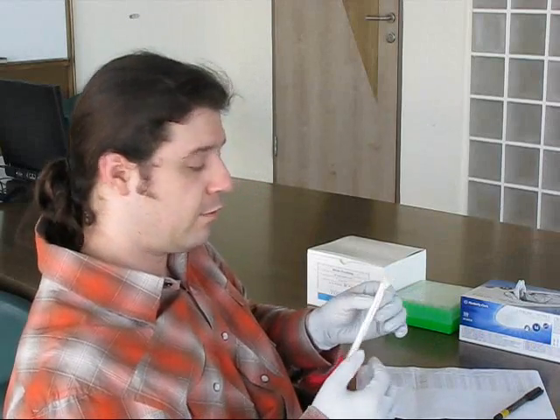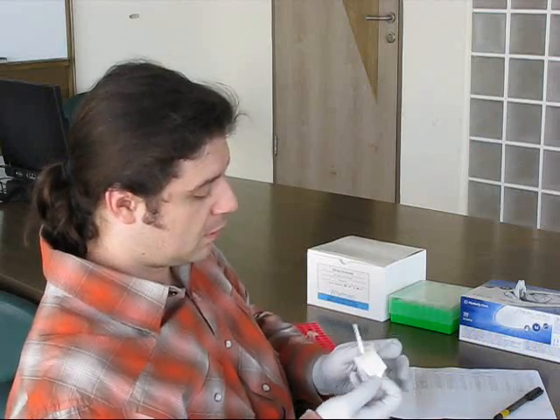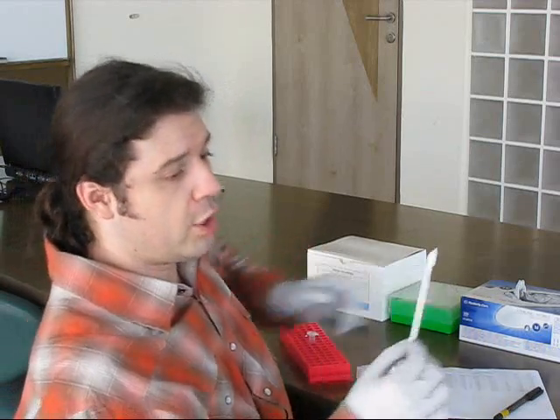I open the stick from the side opposite to the head and give the stick to the patient. He should scrub the inner place of the cheek twice — one minute here and one minute here.